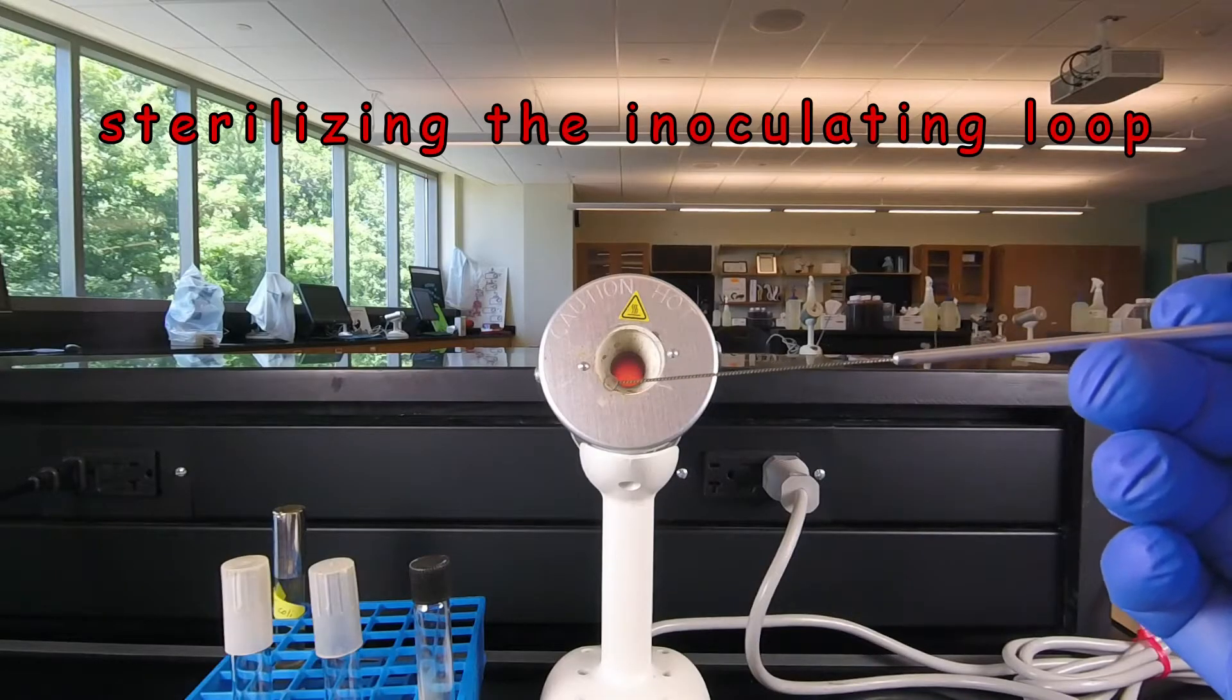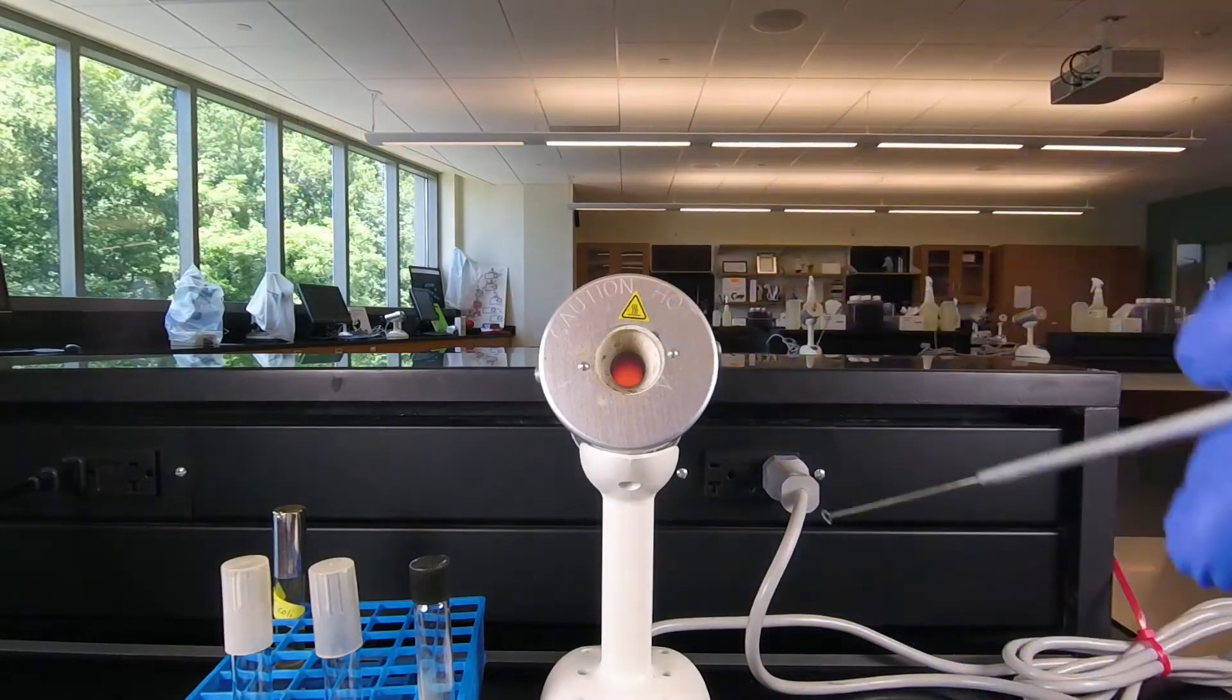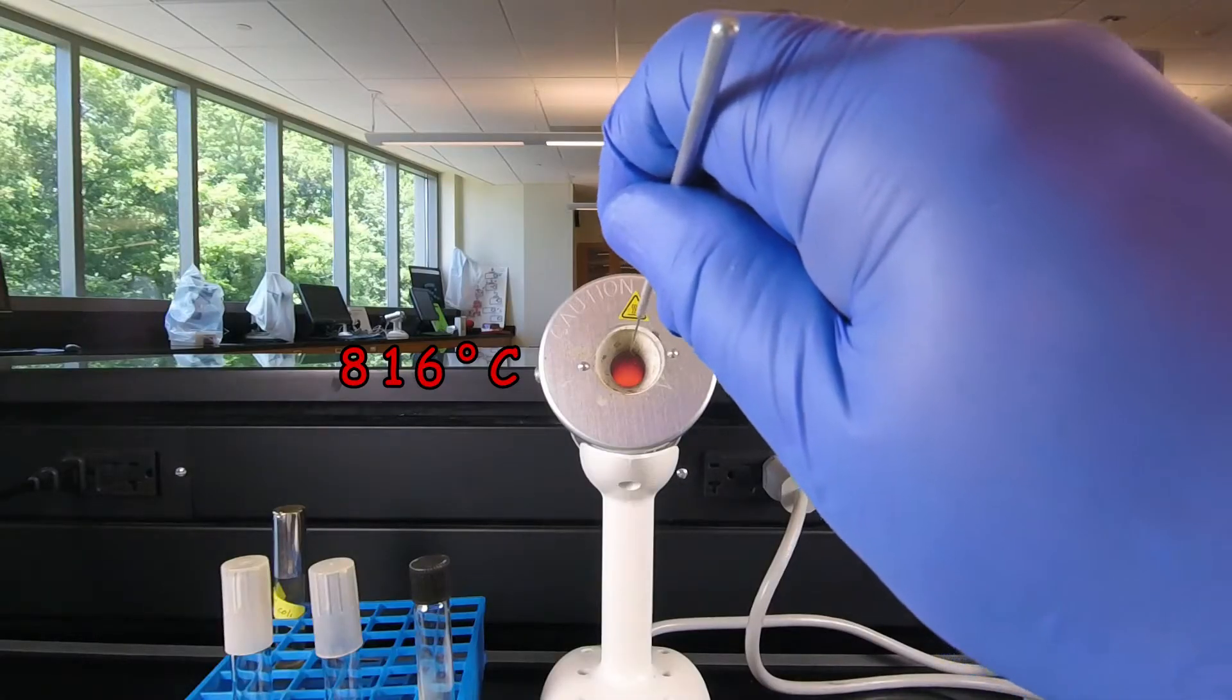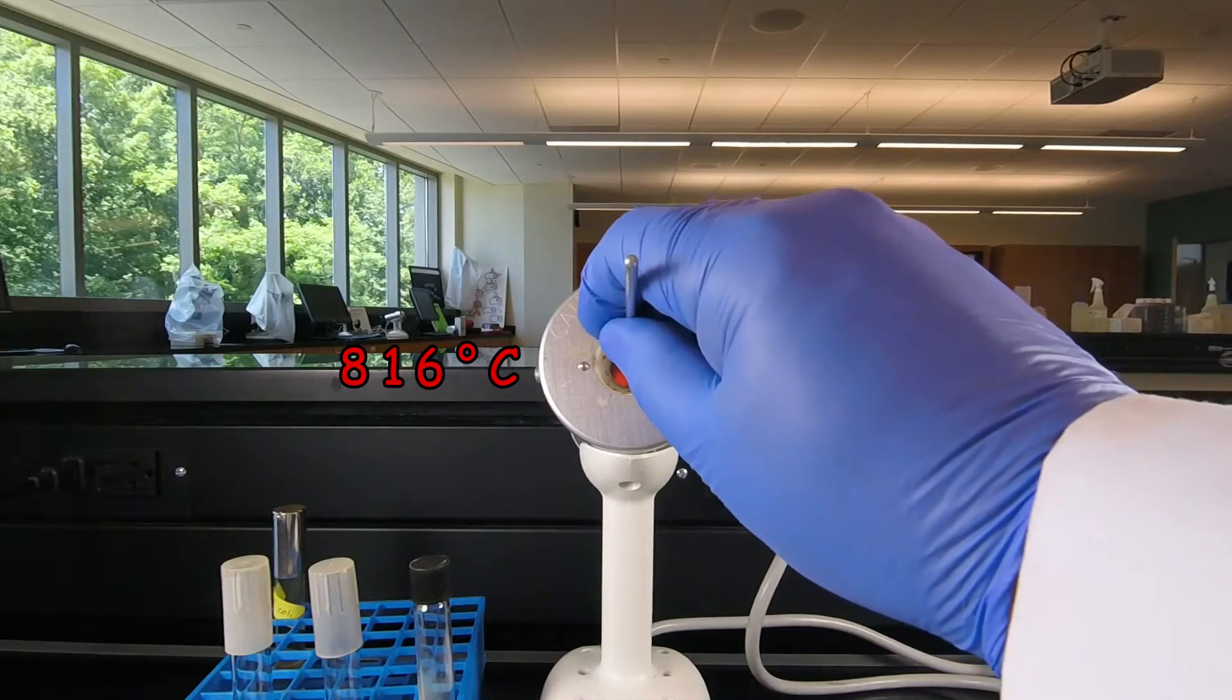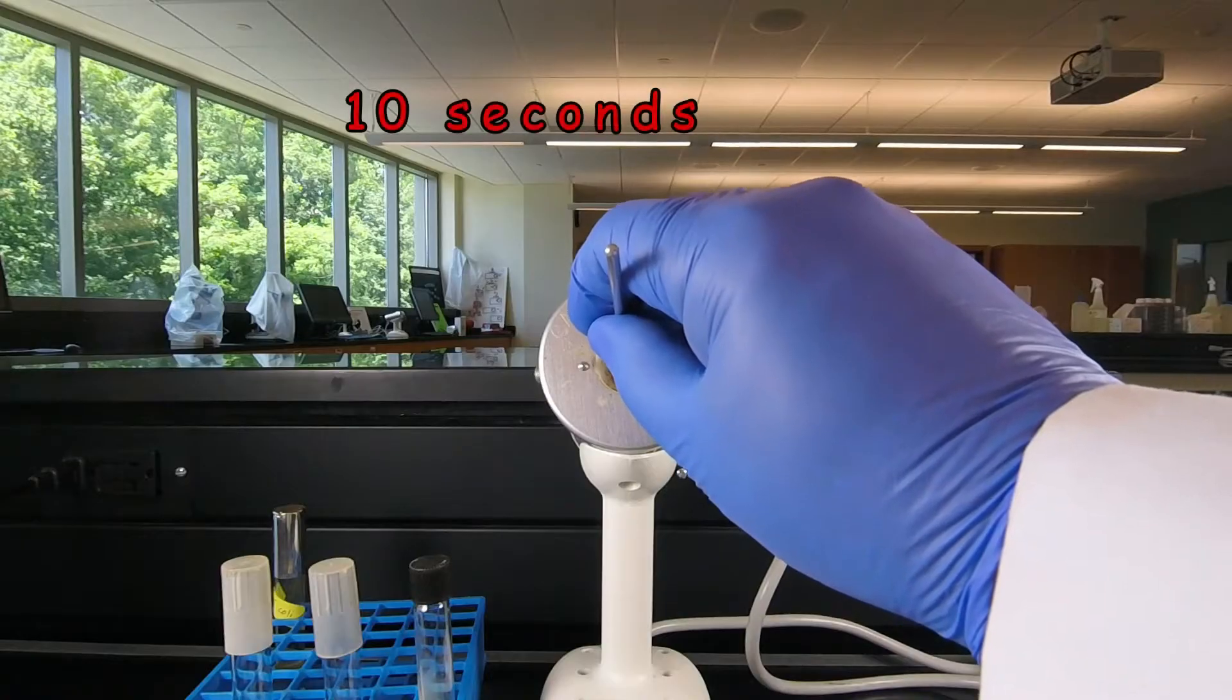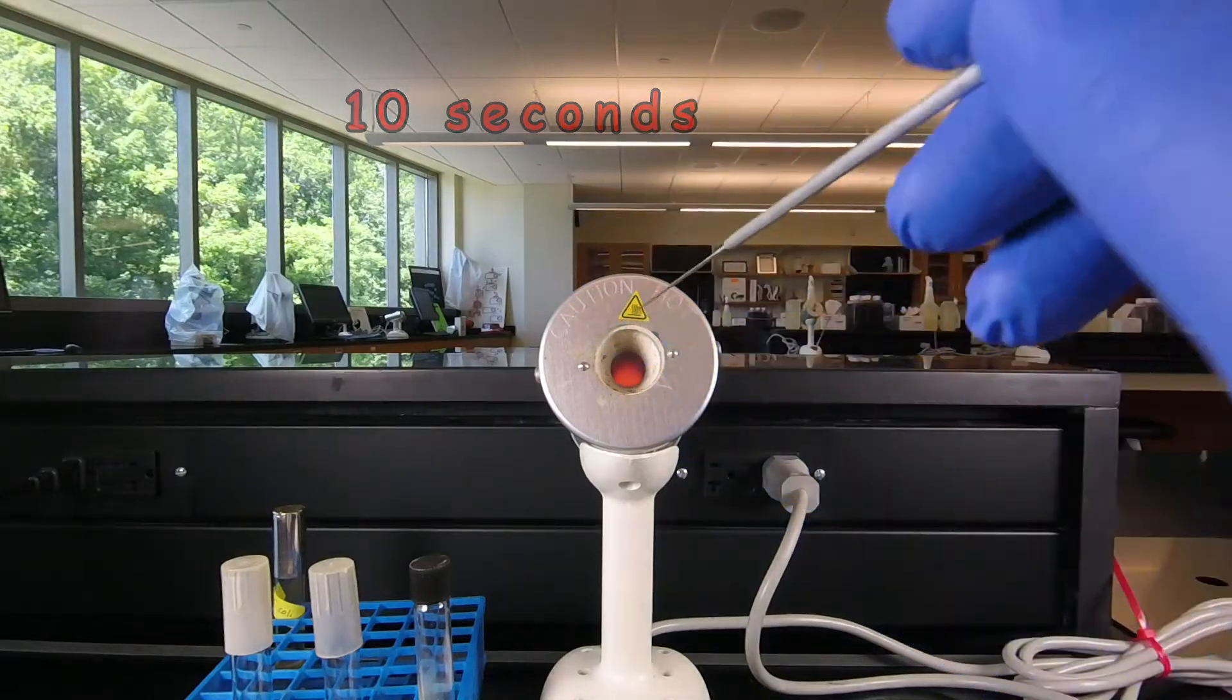We used to use Bunsen burners for this but most of the time today we use Bacto incinerators like you see here. And you'll notice it's glowing orange inside so what we do is we take our loop and we put it all the way in until the beginning of the handle is just where the orange part is and we leave it in for a full ten seconds. And then it's sterile.